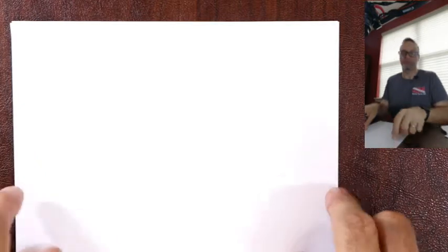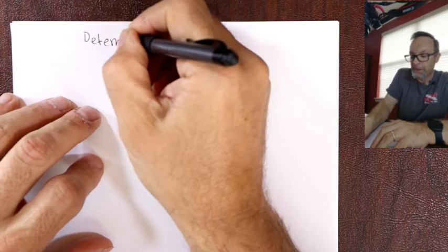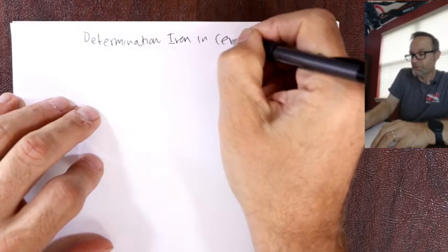Now we'll put that on the back burner for a second because I want to give you my standard pre-lab. So when I teach this in the regular semester, we all come to lab, we have 20 minutes of discussion about the experiment, and I show you what to do and how to get the data. So I'll do that right now. What we're doing is determination of iron in cereal.